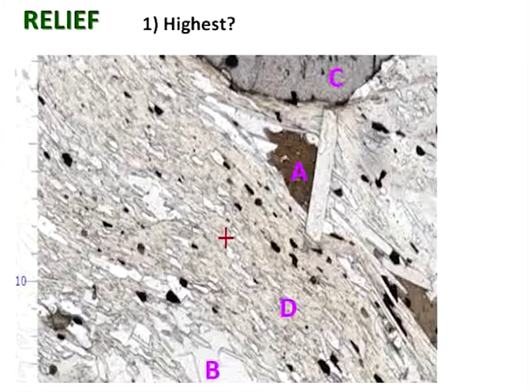So I thought what we might do is we might try and do a poll. What I thought we'd do is have a look at this thin section. This is zoomed in quite a long way, okay? So on the left-hand side, you can see the millimeter scale. That makes it a little bit blurred. Let's see if we can guess which of those lettered minerals, labeled minerals, is the highest relief, if you could all vote on that.